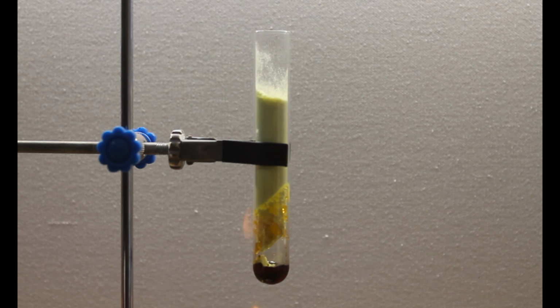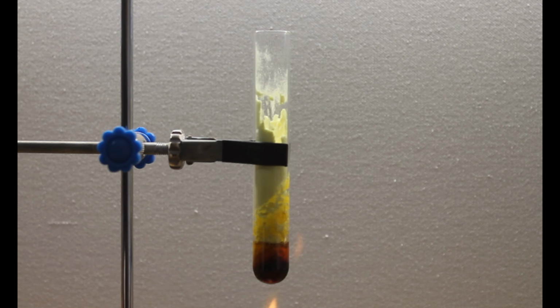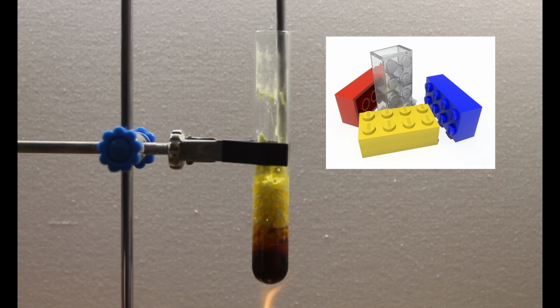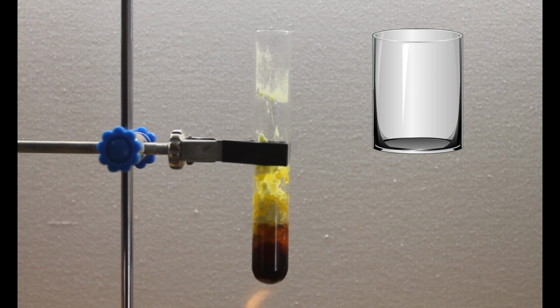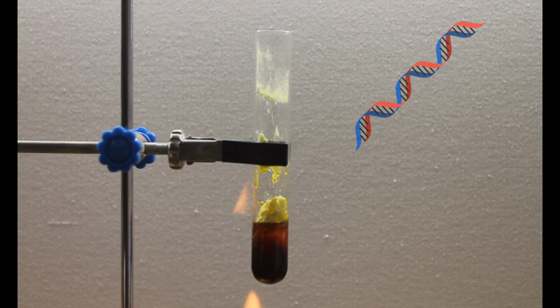Now, as we're doing this slowly, it can take a while, so we have sped up this footage. But whilst we wait, let's have a think about what a polymer actually is. A polymer is a long repeating chain of molecules that often take on some interesting properties. Some commonly manufactured polymers include plastics and glass. Many polymers actually occur a lot in nature, such as wool, and even your own DNA is made of polymers.